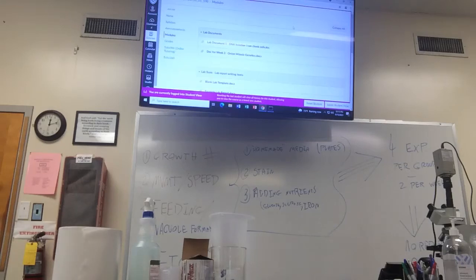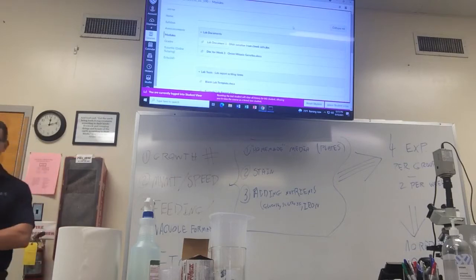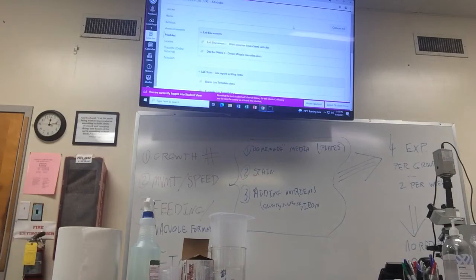So I just want to talk for a second about the next couple of weeks, what it's going to look like as far as what we're doing in here. Today we've got deciliation. We're going to knock the legs off these Tetrahymenas. And then the following week we'll do feeding and vacuole formation.